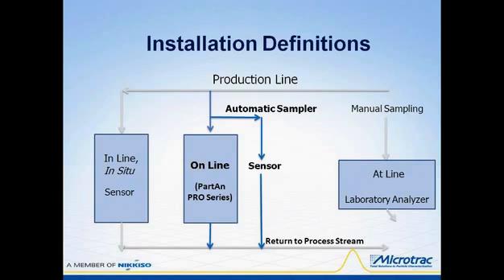protocol listed here, and that is the one that Microtrac uses. We have an online sampling of particulates. Here, sampling systems are applied to representatively sample a particulate process stream over a short period of time and divert the sampled stream to the particle analyzer. And there are well-established representative particulate sampling systems which can be applied to various types of streams depending on the process and the sampling point.